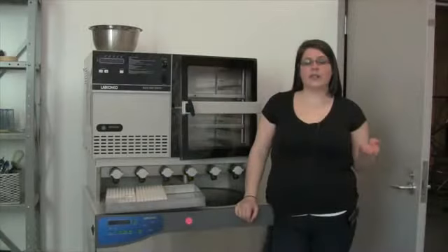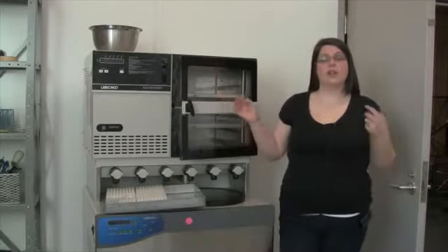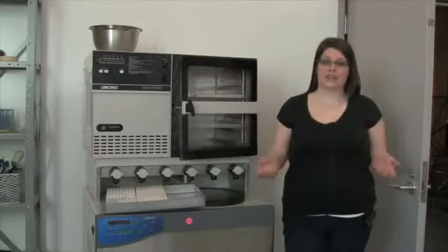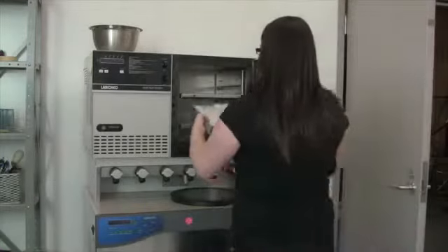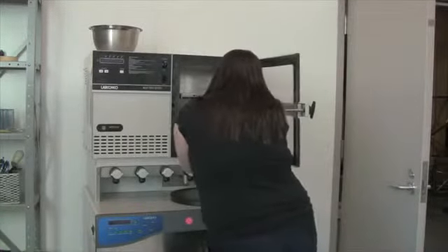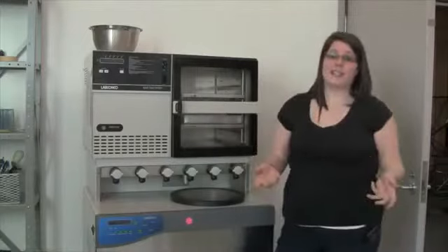It is important that samples are frozen immediately after collection. Once frozen, they are put into a freeze dryer where low pressure and temperature draws moisture out of the tissue, dehydrating them. These are subsamples of my tissue collected in the field, which now go into the freeze dryer. This process takes a week.